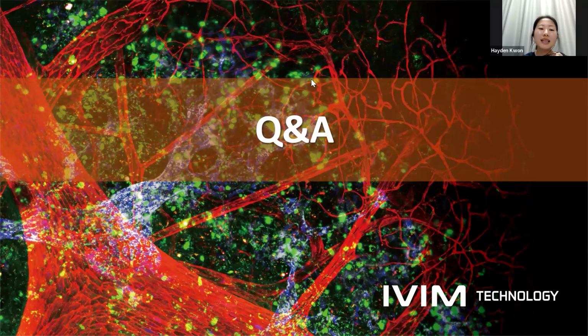So you could easily label your target cells in your lab in just a few hours, I think. And for the surgery, we need to slightly open the skin with a simple incision for terminal or short-term imaging. But for long-term imaging, as you could see in the previous slide, you need to do some surgeries for implanting various windows.